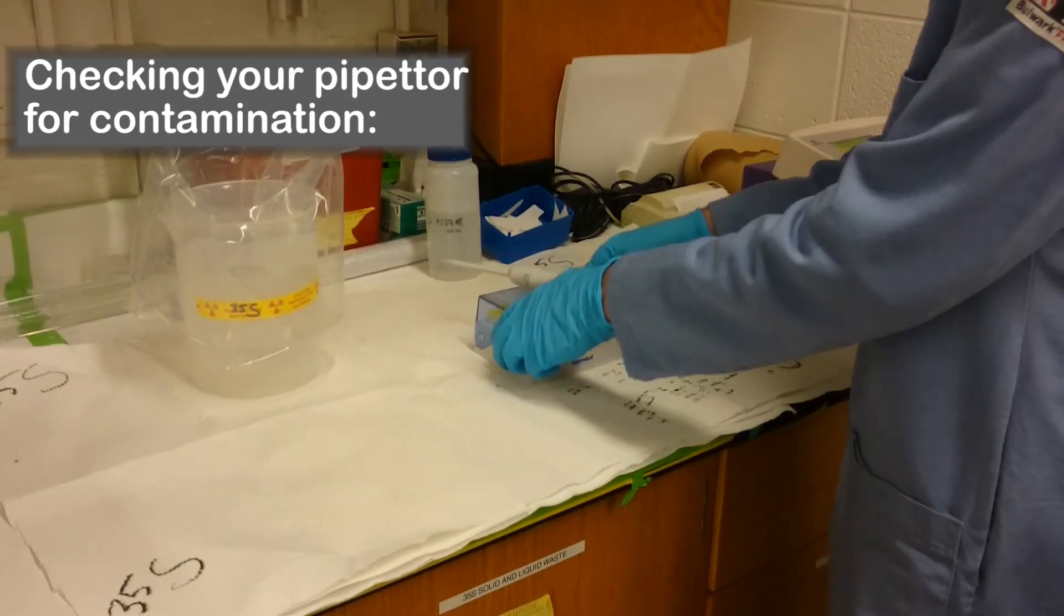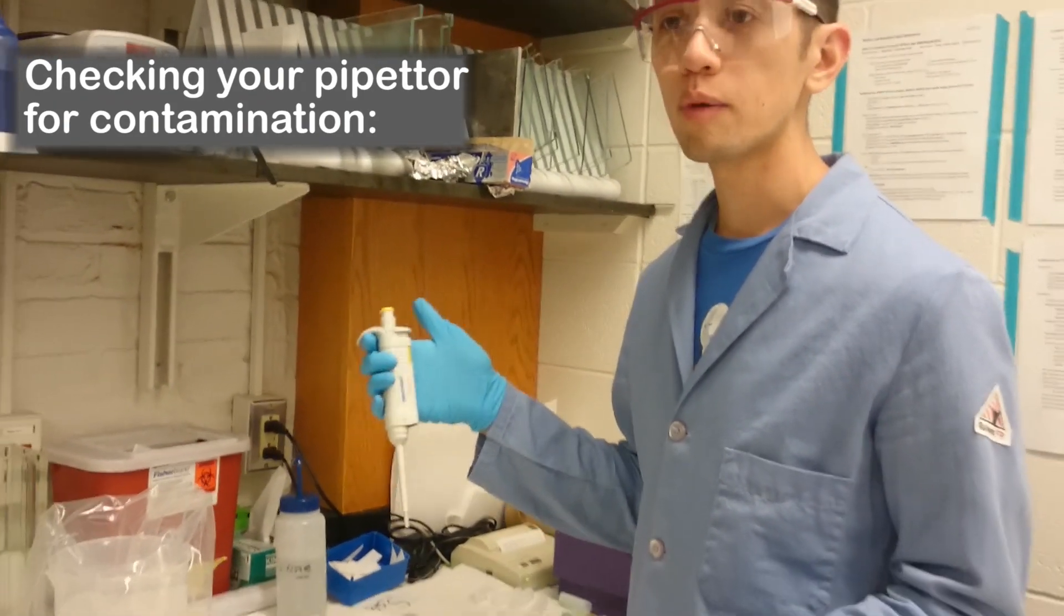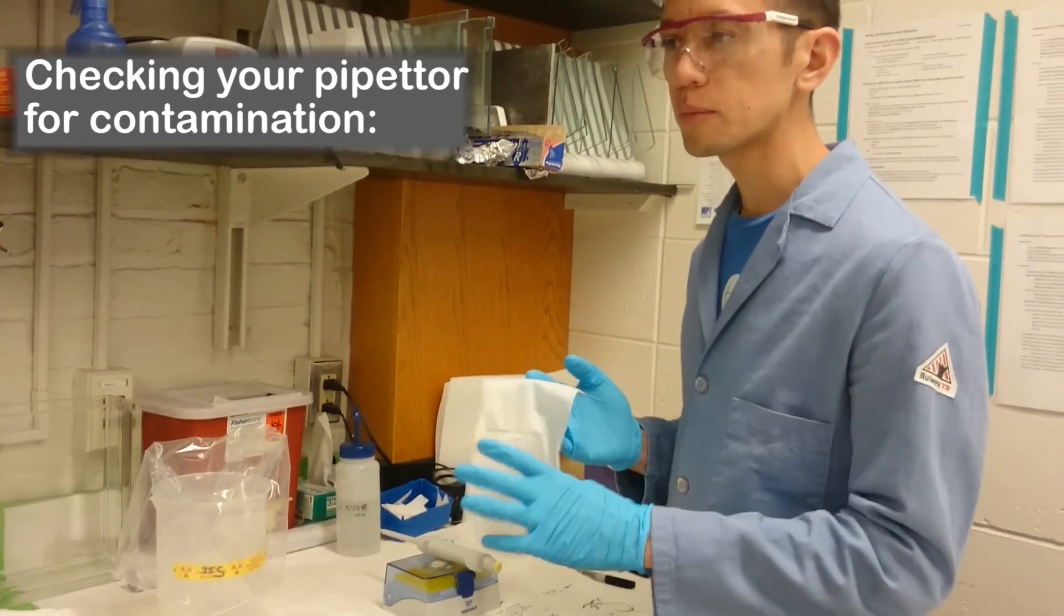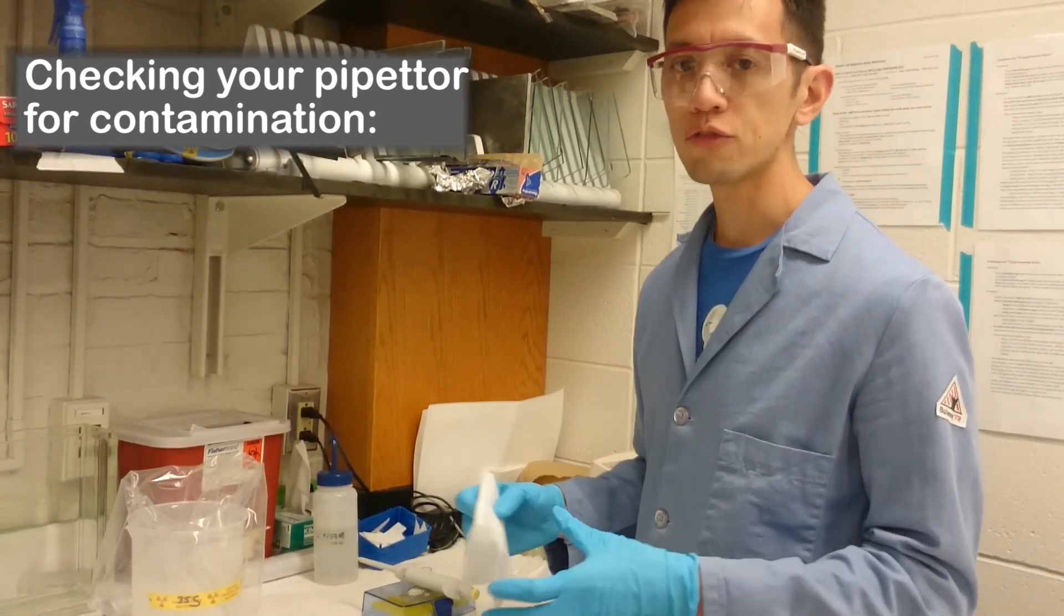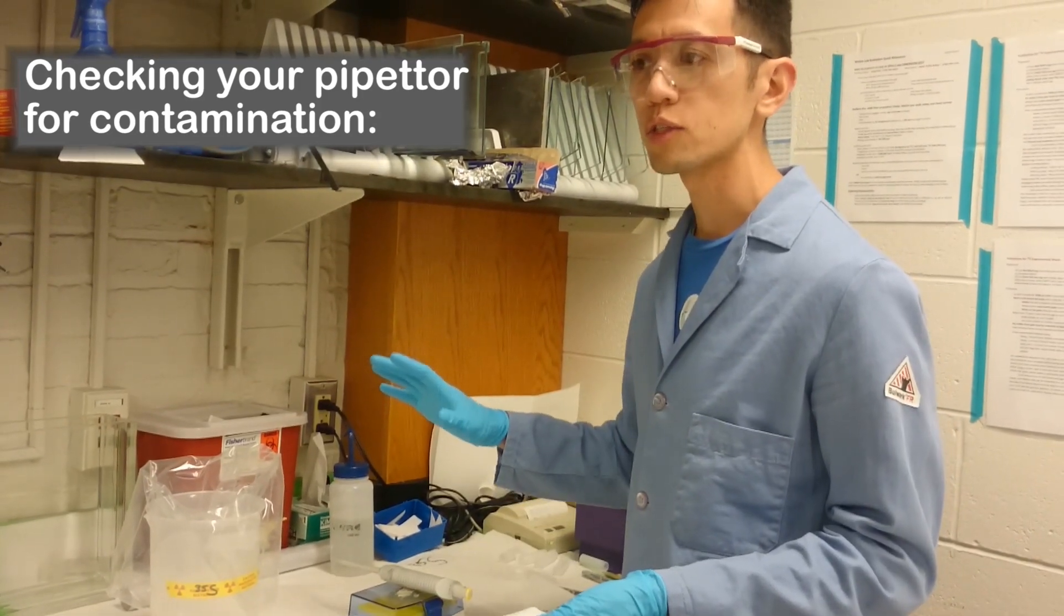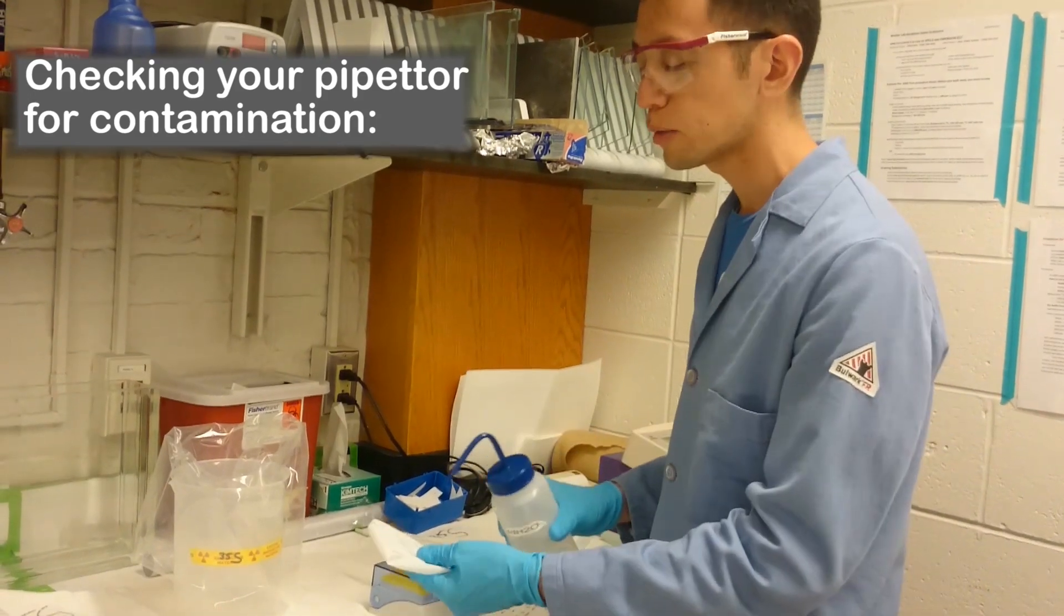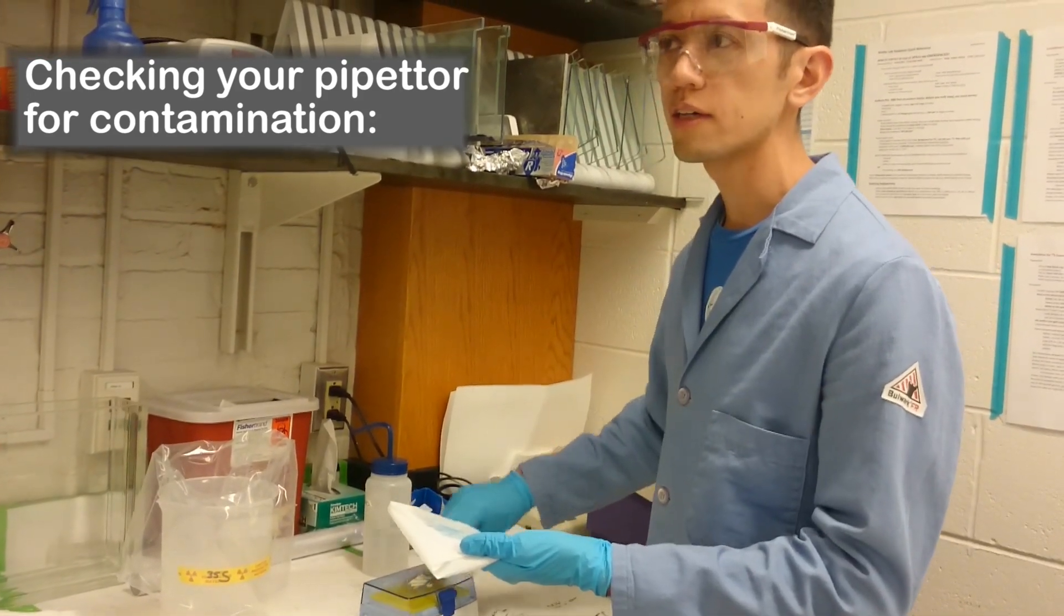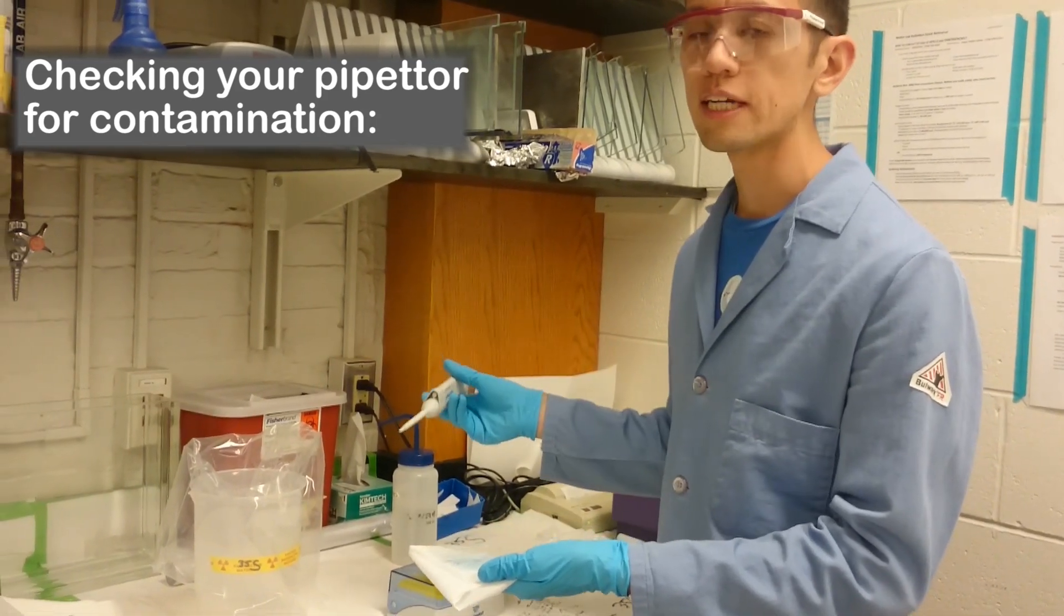Let's say I've done an experiment. I want to show you now how to clean a pipettor. Usually when you have small contamination, a Kim Wipe with water is usually enough to clean it off. Static electricity can also be a problem when you're counting scintillation vials, so typically I preemptively clean things and that will help to reduce the need to re-swipe things.